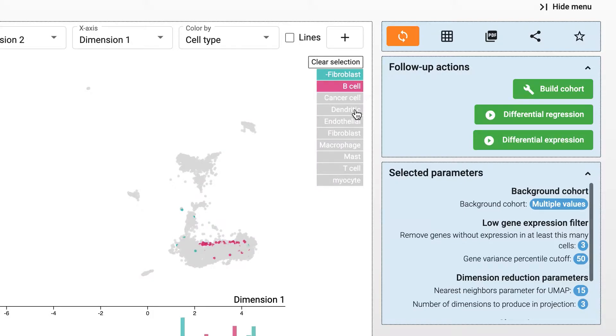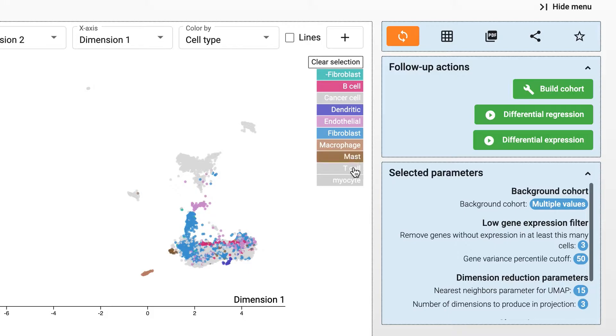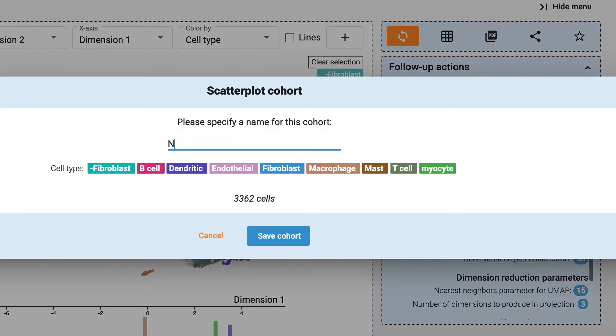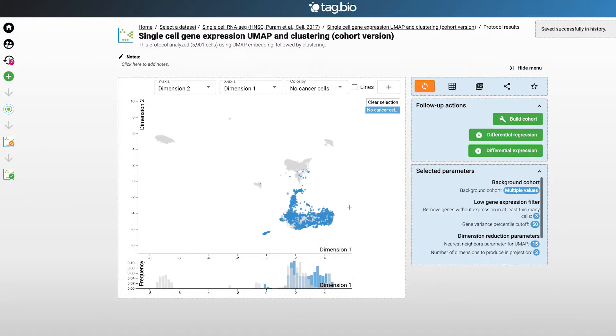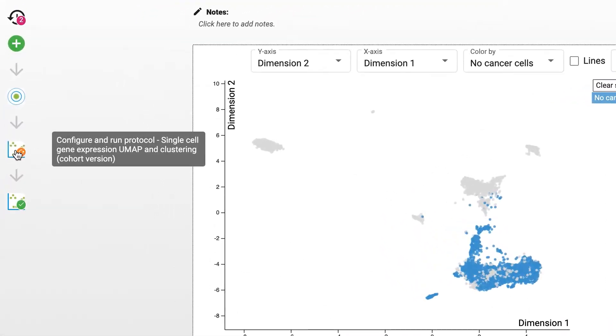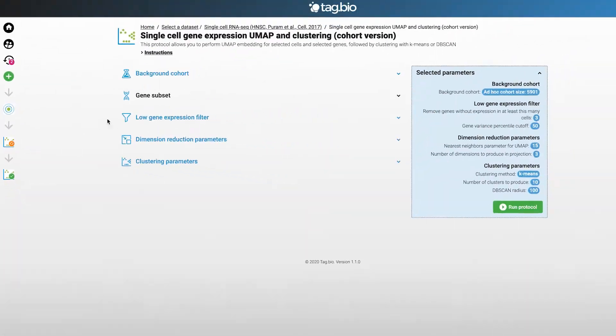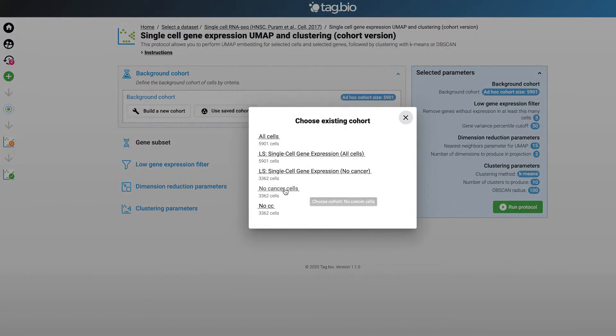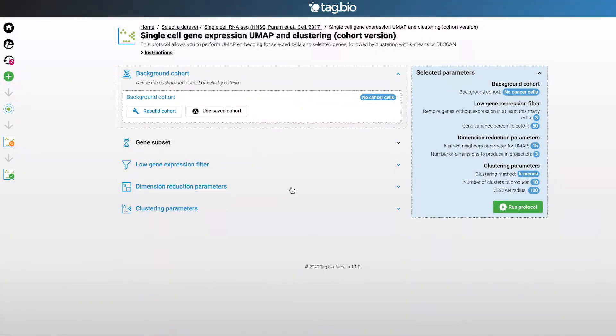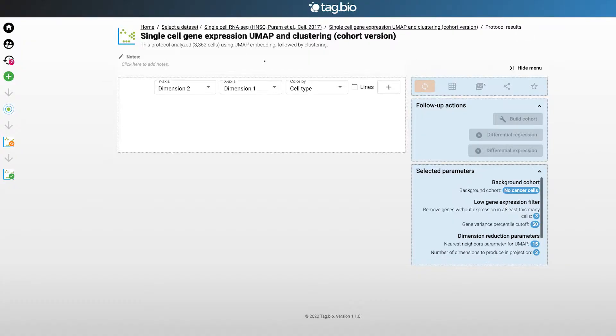To do this you select all the cells apart from the cancer cells. Then build a new cohort. To use this new cohort you go back to the reconfigure page, select the new cohort, and run the analysis.